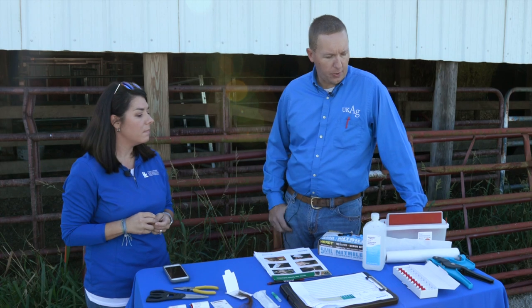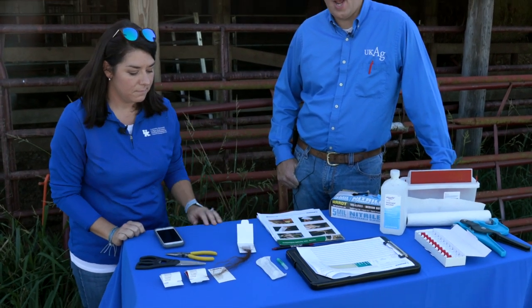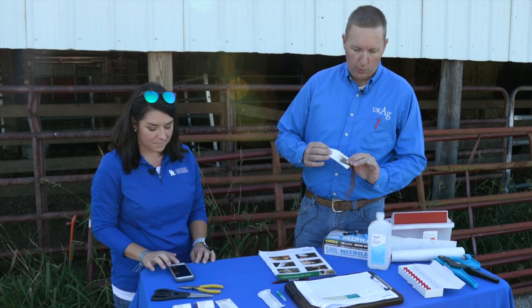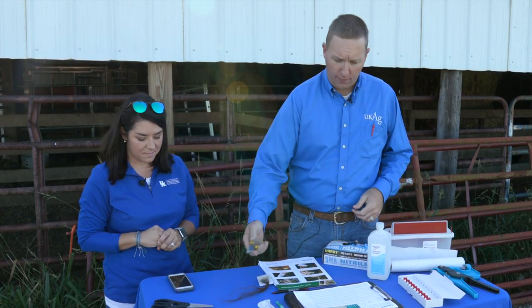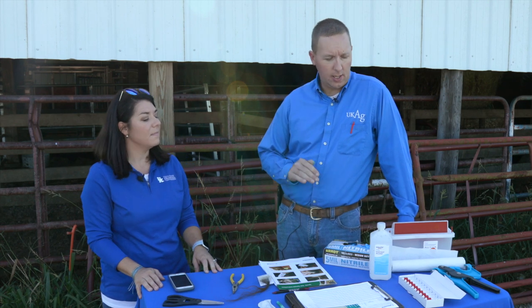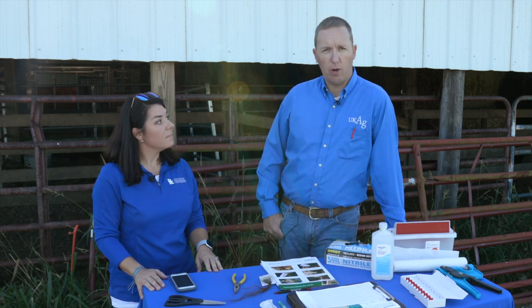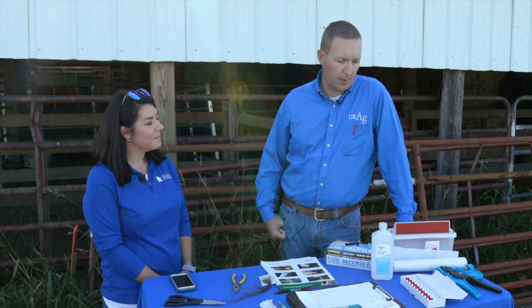For hair samples it's really pretty simple — we call the lab that we're asking to do our DNA work and they will ship us out hair cards. Basically this is a two-ply collector that has a sticky side where we put our hair follicles. We'll need just a simple pair of needle nose pliers — needle nose seemed to work better. The main goal is to get a clean sample, so some type of cleaning agent like alcohol to clean between cattle, and I always like to wear nitrile gloves so that we don't contaminate those samples.